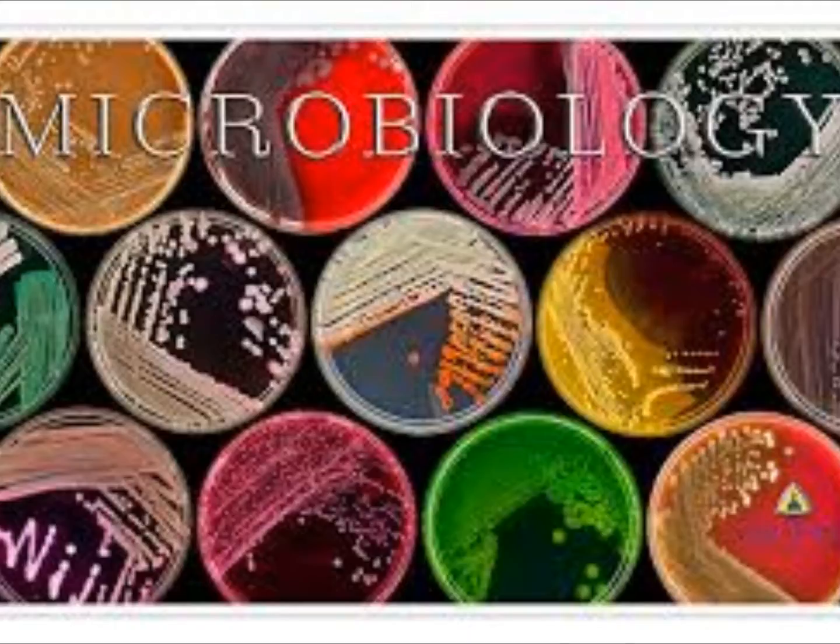So those particular characteristics aid us in the identification of the organism. Kind of gives us an idea of what step to take and what biochemicals to set up and things like that. And we generally observe those characteristics at 18 to 24 hours. So that's why we had you guys sub those organisms today. And then tomorrow, you're going to go get your organisms out of the incubator. You're going to have a worksheet sitting there, and you are going to assess the morphology of your organisms. And they will have been incubated for about 18 to 19 hours.